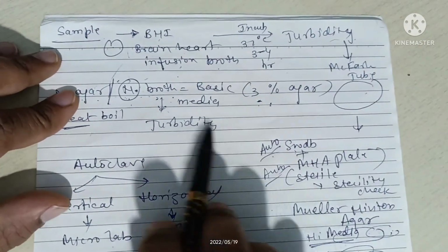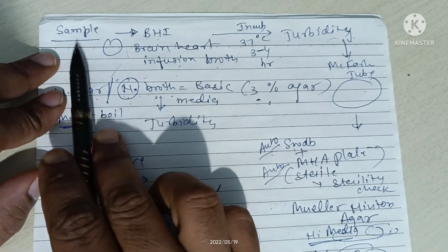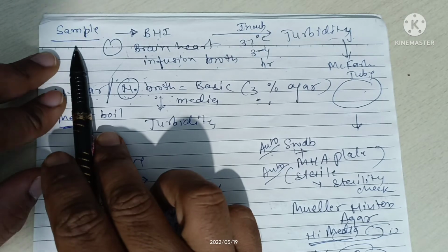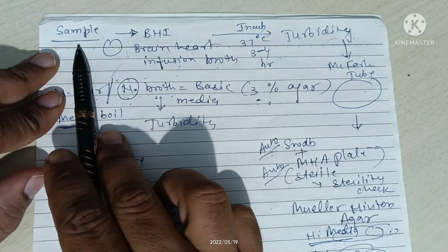First of all, we have to take a sample. The sample may be milk, blood, any kind of pus, or urine. There may be any kind of sample, like nasal discharge.